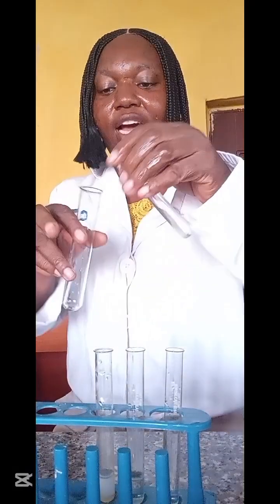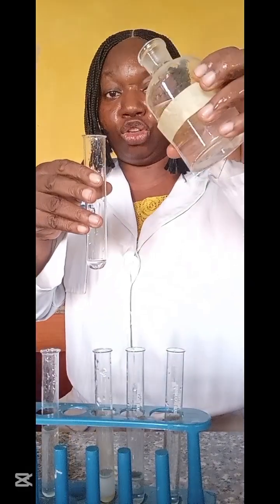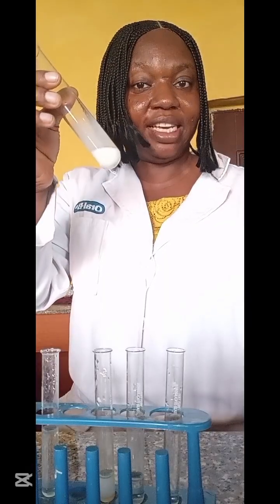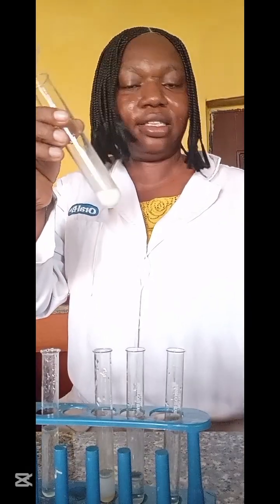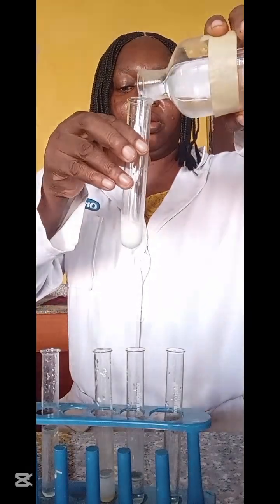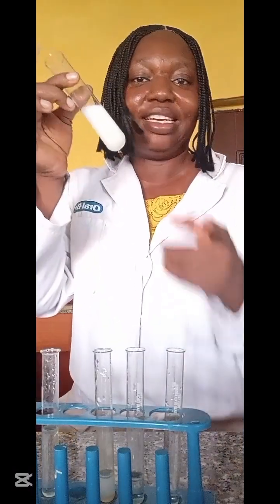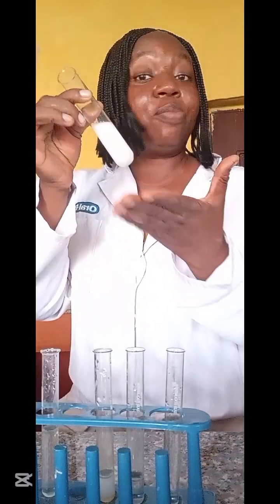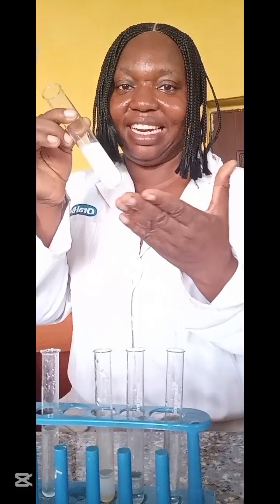Now the last one of the white. This is calcium. Calcium in sodium hydroxide gives a white chalky precipitate just like that. In excess, can you see? Does not dissolve. That is a typical property of calcium. The precipitate is insoluble in excess.